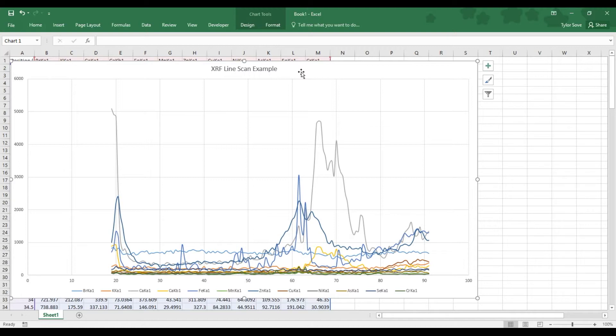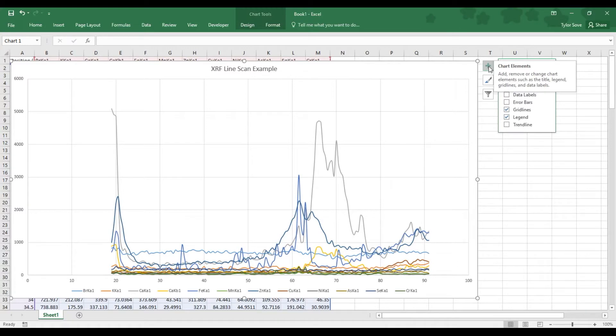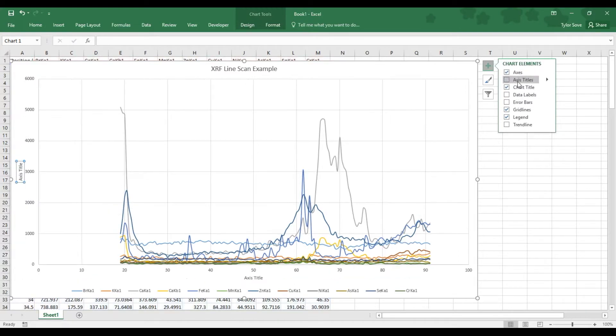Now, the next thing that this chart is missing is Axis Titles. As right now, our X and Y axis are meaningless without these titles. So, click the chart's elements green cross to the top right of the chart. Select the Axis Titles option.